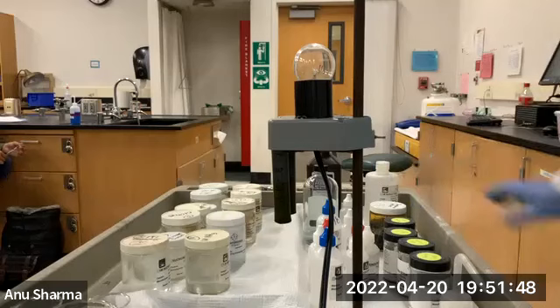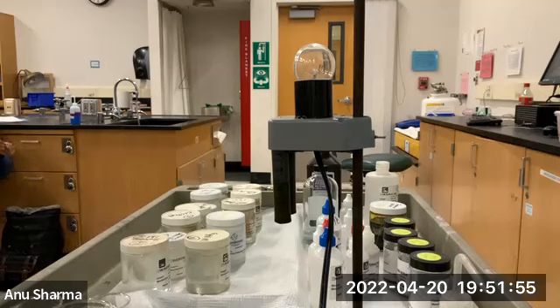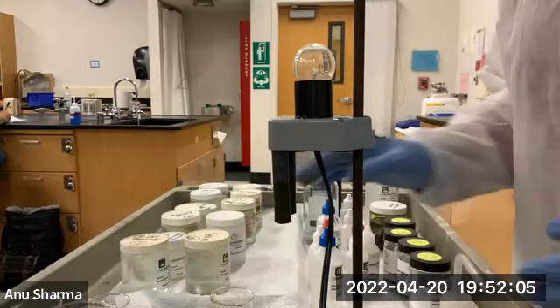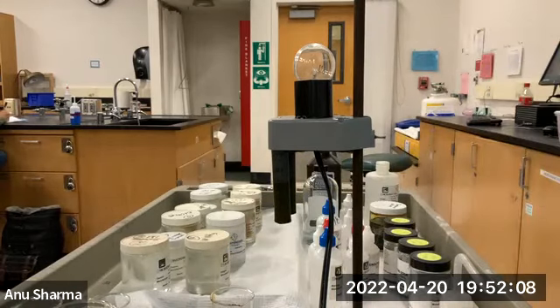So that's the story with this guy. You're going to write down here, soluble in water, yes. Strong electrolyte, just put strong electrolyte. Major species are hydrogen ions and iodide ions, and minor species, none. All right, so that finishes the demonstration. If you guys have any questions right now, you ask me, and I'm going to just stop the recording.